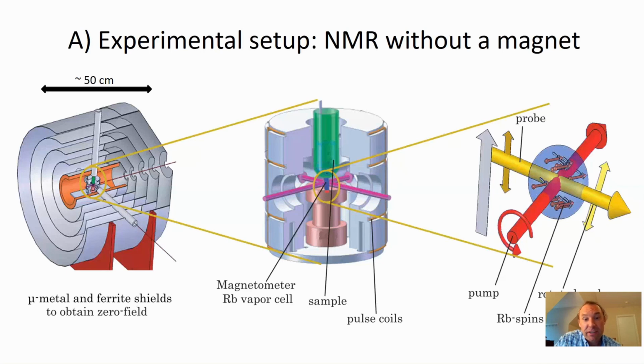But now, because of the action of a magnetic field that comes from the top, the electron spins start precessing around that magnetic field to some extent. At the same time, the pump beam pumps them back to where they came from. So some kind of equilibrium angle gets established that can now be read out by the probe beam. And we're going to talk about that in a moment, one more time. But I hope that I have illustrated the overall components that are required for a successful ZULF experiment.